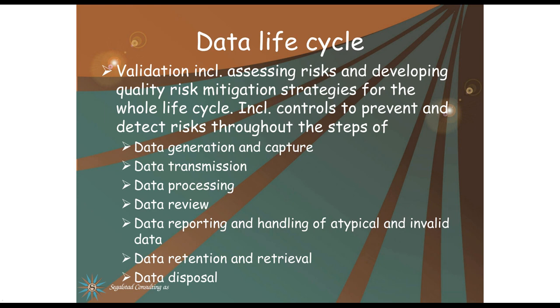Data lifecycle. Validation, including assessing risks and developing quality risk mitigation strategies for the whole cycle. Well, we covered validation a few slides ago. What I did not mention there was that validation shall be risk-based. Data itself also needs a risk strategy. This includes controls to prevent and detect risks throughout the steps of data generation and capture from an instrument or from other sources.